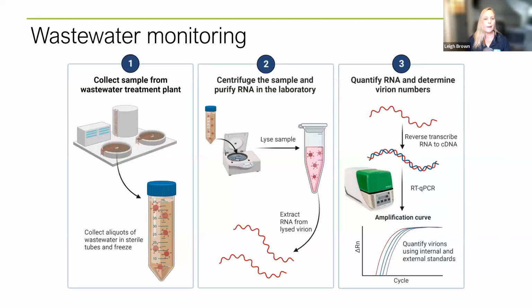So how does that happen? Well, there are actually little robotic sample takers, and that's not the right word, but I'm drawing a blank here, that will go and collect samples from the wastewater treatment plants. I've heard them described as the size of R2-D2, which gives me a good idea of what that might look like, right? And so they're going and capturing a sample of wastewater. They might do this every day, or every X number of hours.